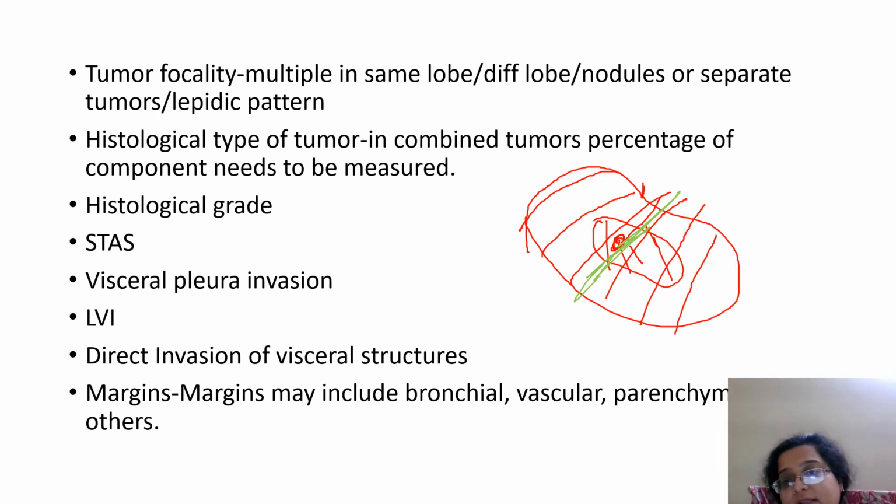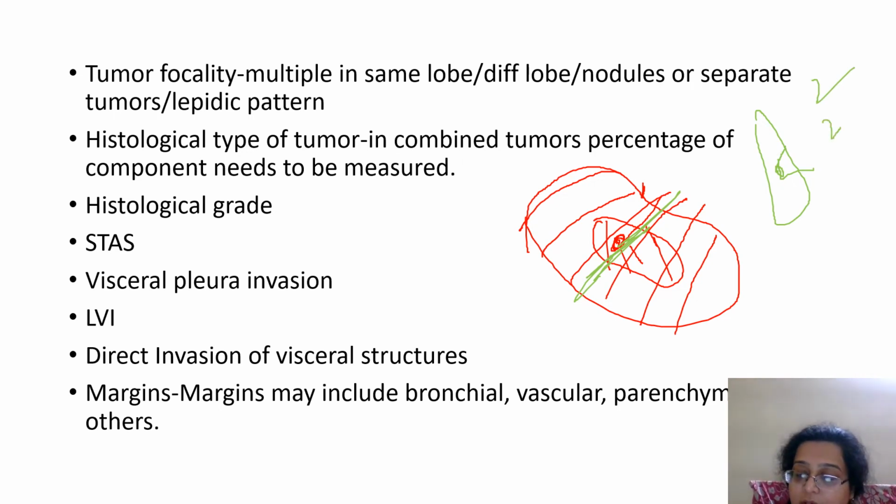Now if I have this one slice in front of me with tumor over here, then I'll take 4 sections from lung and tumor. In the 4 sections, there'll be 2 purely tumor, 2 appearing normal lung and tumor, then some section from normal appearing lung. If I'm fortunate enough to have a bronchus in that section, I'll take section from that. If there are vessels, I'll take section from that. Why? Just to see if any invasion is there or not.